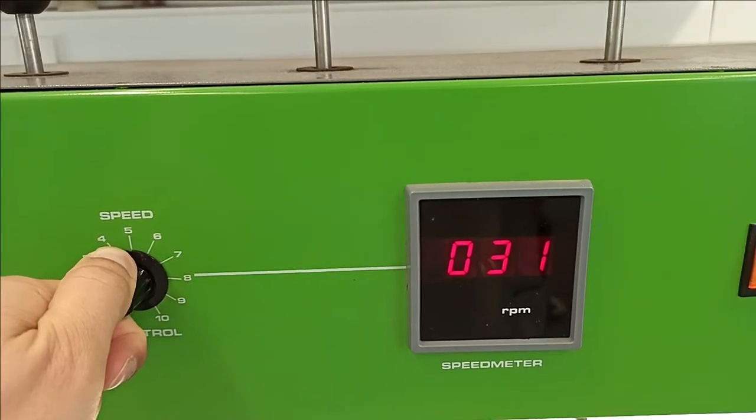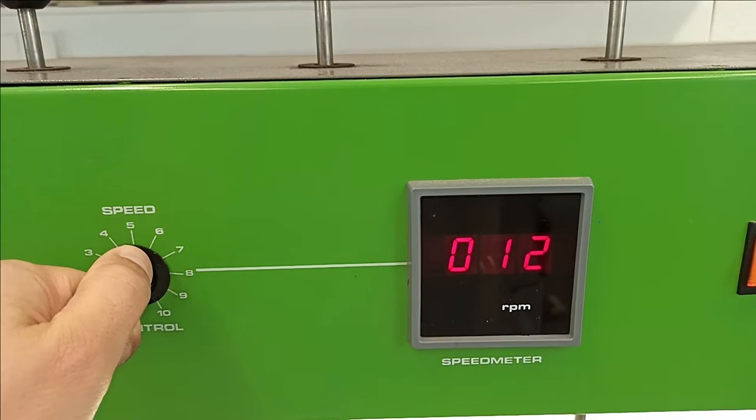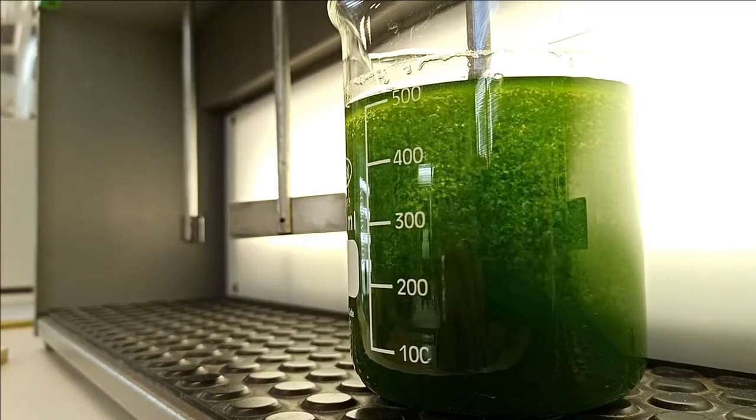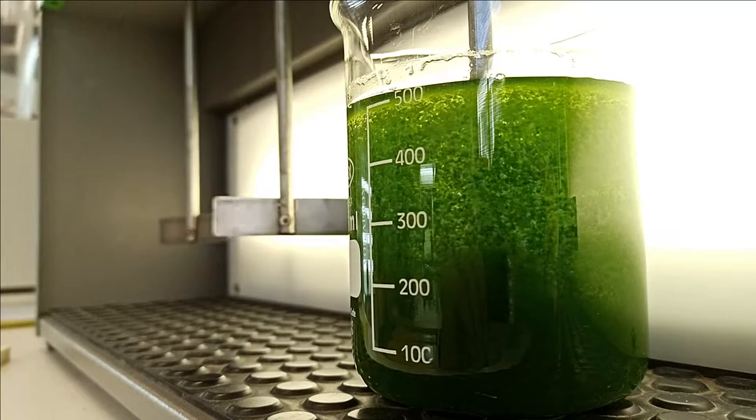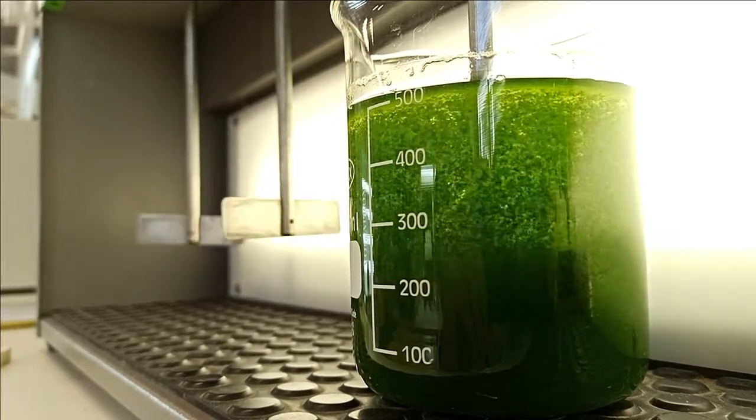After 1 minute adjust mixing to 15rpm for 3 minutes. During this time the low agitation speed allows coagulated cells to aggregate into flocs.